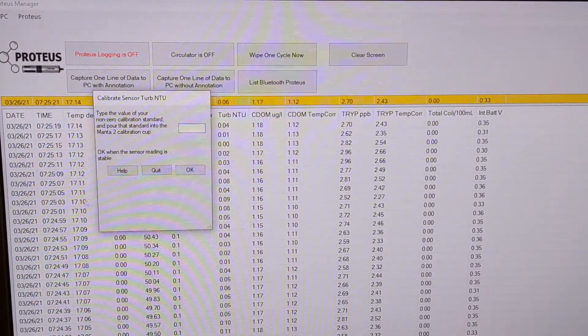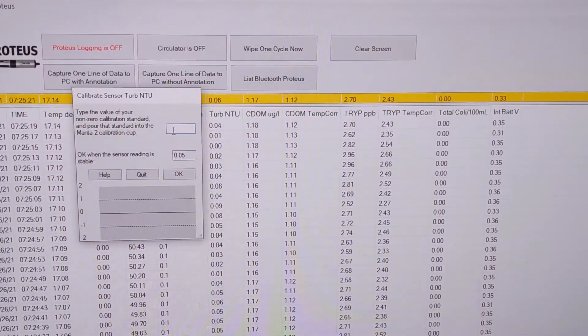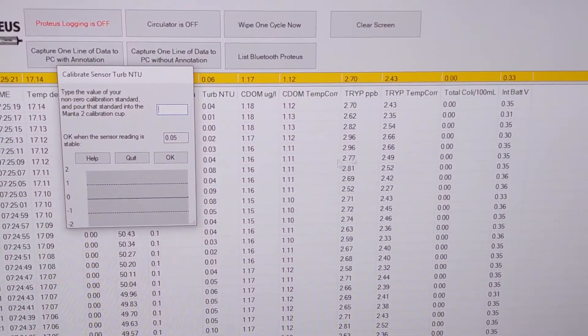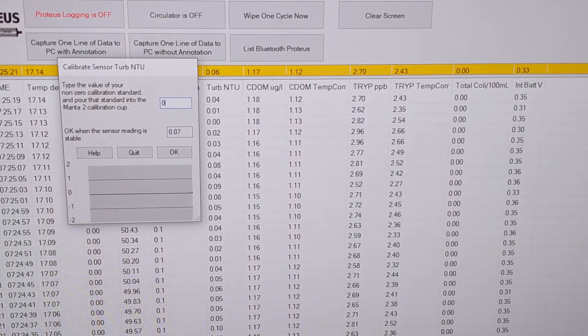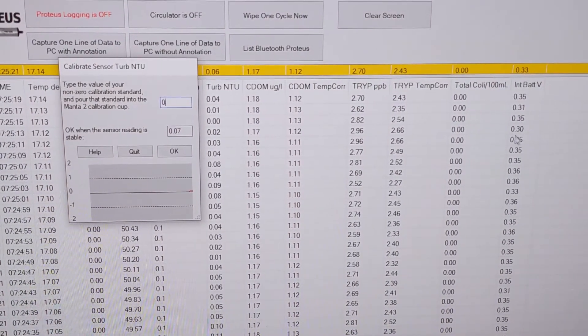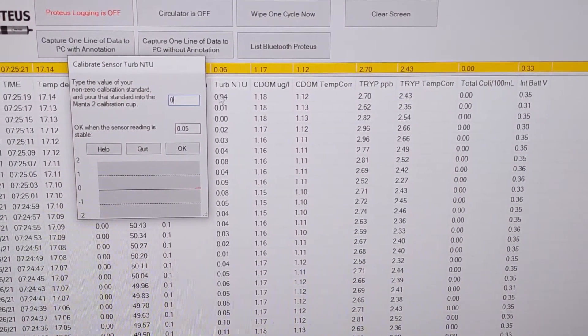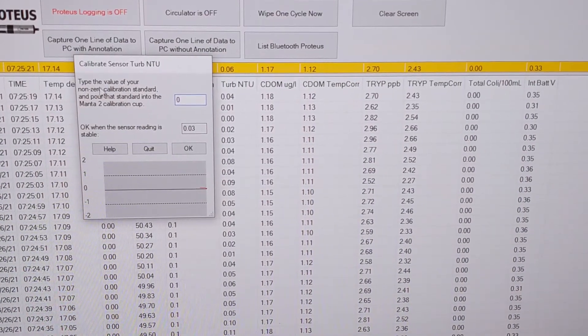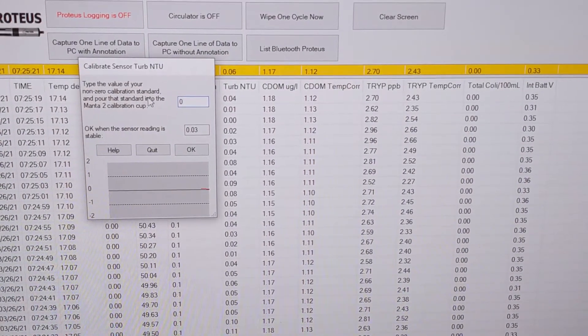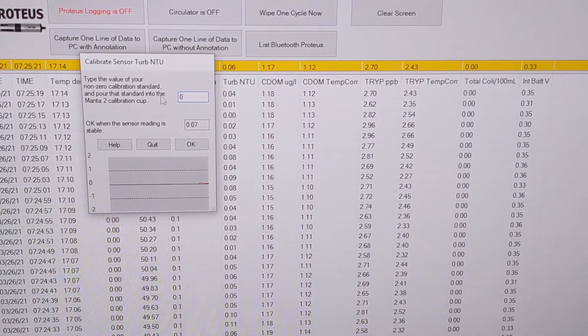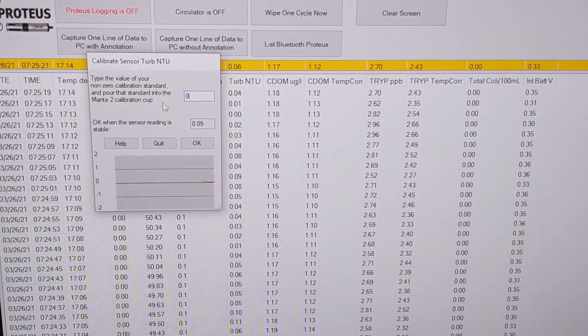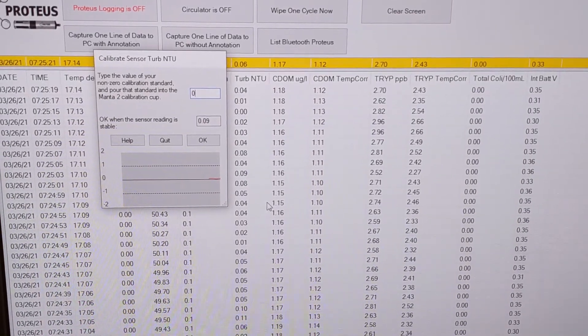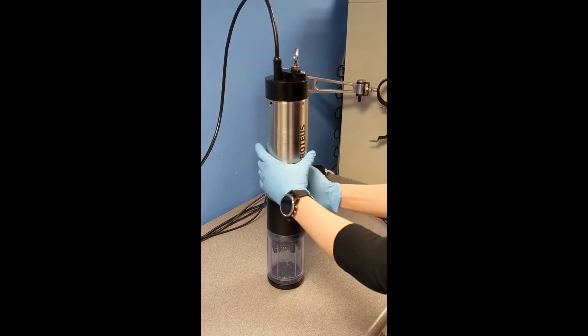And then it'll bring up this window here where you can type your first value of calibration fluid. So we're going to do a zero point first, so I'll put it in there first. It says here type the value of your non-zero calibration standard, however we're going to do zero first, so ignore that part.